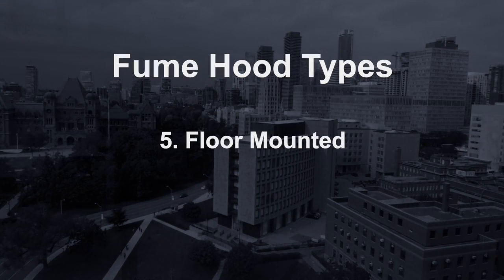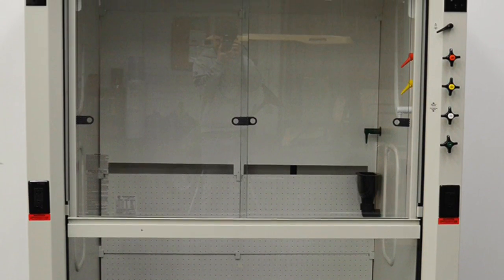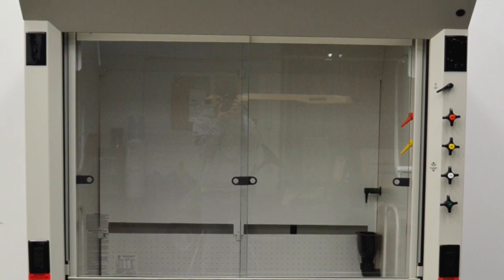Floor-mounted fume hoods. These fume hoods are characterized by a floor-level work surface. They accommodate large and heavy pieces of equipment.